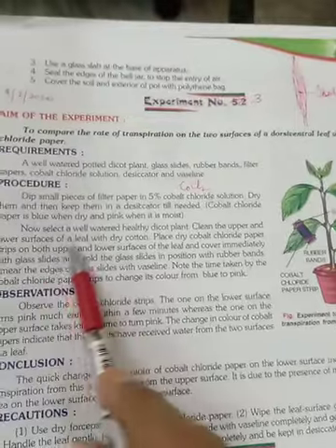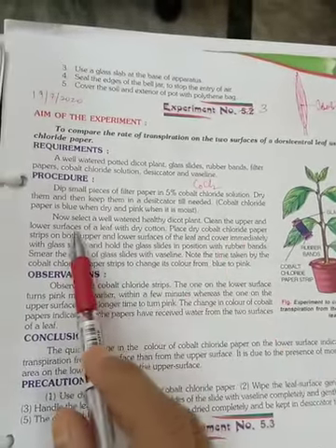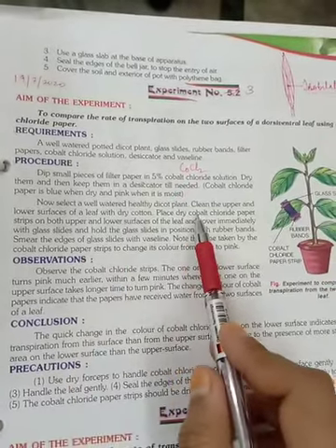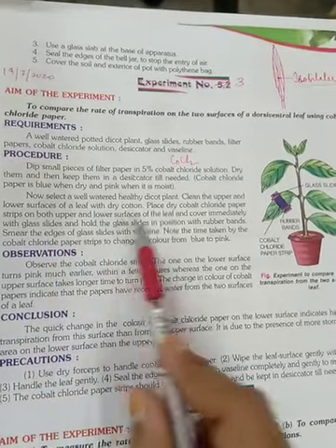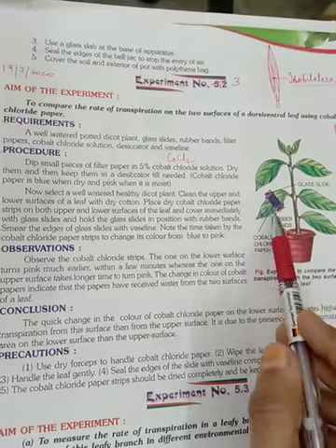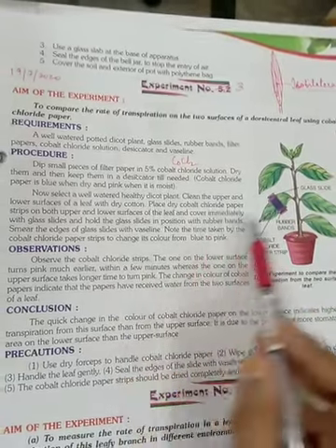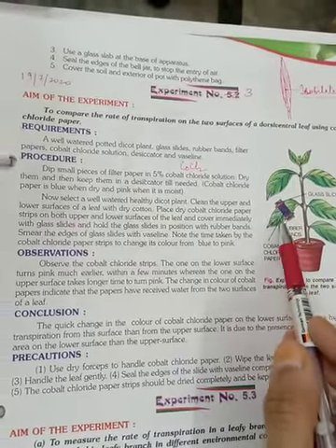Now, select a well-watered, healthy dicot plant. Clean the upper and lower surfaces of a leaf with dry cotton. Place dry cobalt chloride paper strips on both upper and lower surfaces of the leaf like this and cover immediately with glass slides and hold the glass slides in position with rubber bands. Rubber bands will secure the glass slides nicely over the leaf.